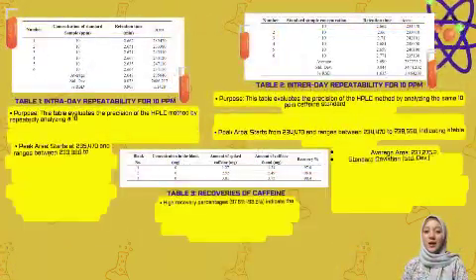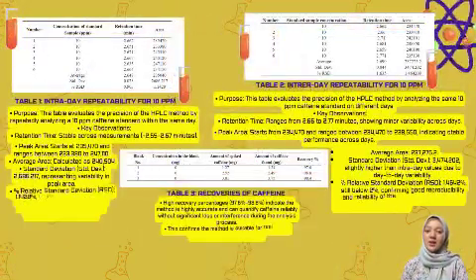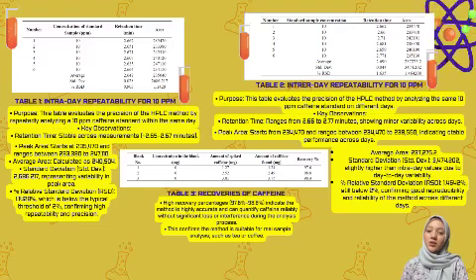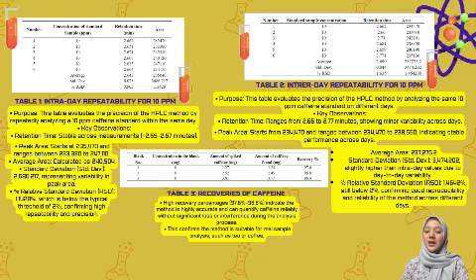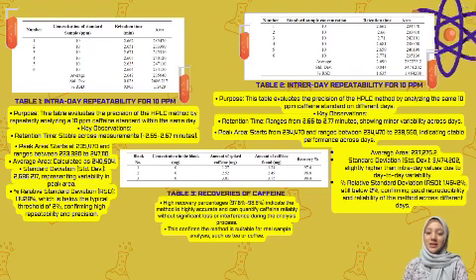Table 1 and 2 highlight the method's precision. Intraday repeatability results show minimal variability with an RSD of 1.14%, while interday repeatability had an RSD of 1.46%. Both are well below 2%, indicating excellent precision and reproducibility for this analysis.